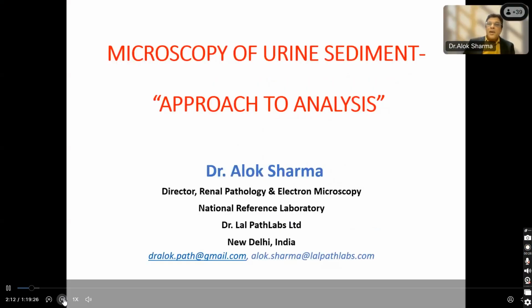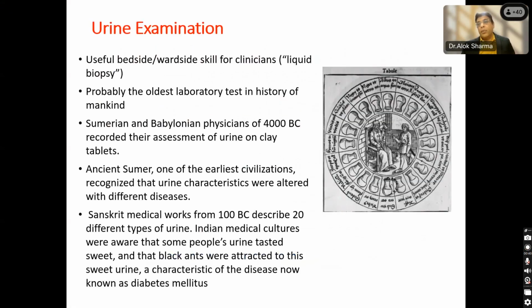And today we will be speaking about microscopy of the urine sediment, and how do we approach it. There'll be a lot of things to it. We'll see how it progresses. And probably there is a slide seminar next week also. So what we learned today as a part of the whole system, we will try to put into practice next week. So, beginning, just a basic background on urine cytology.